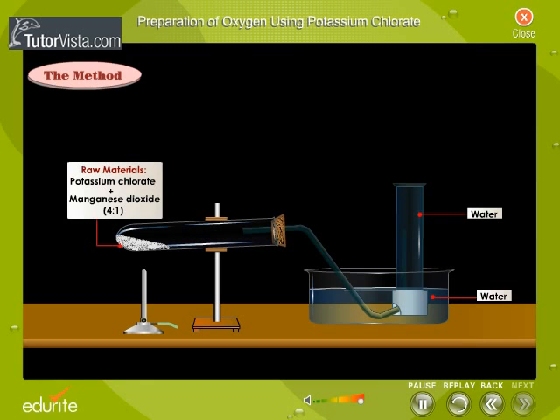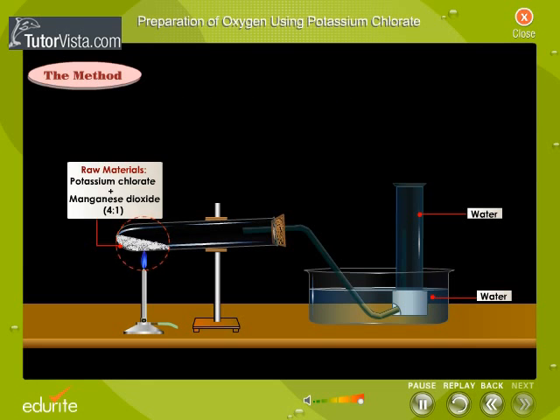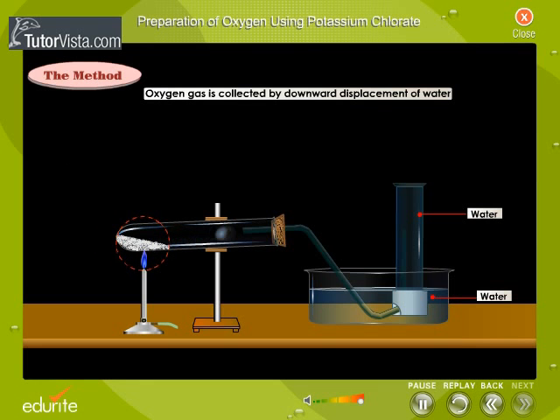Take a mixture of potassium chlorate and manganese dioxide in the ratio of 4 to 1 by weight in a hard glass test tube. Heat the test tube. Oxygen gas is liberated and collected in the gas jar by the downward displacement of water.